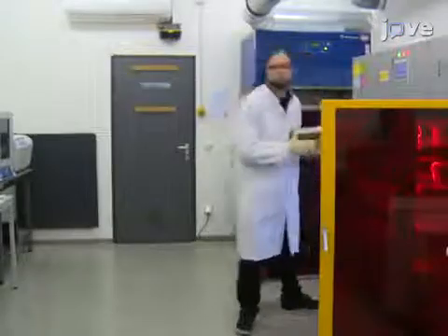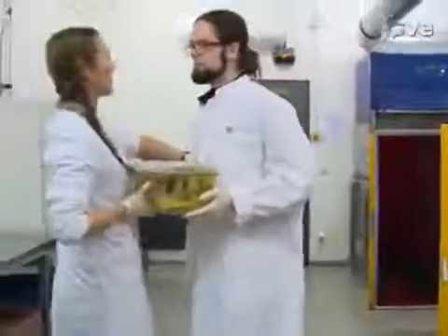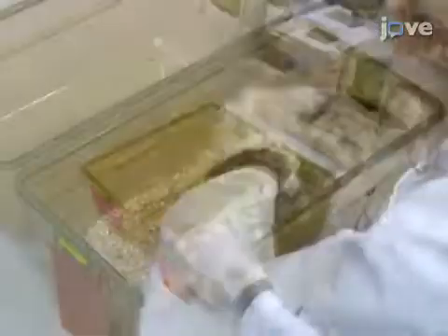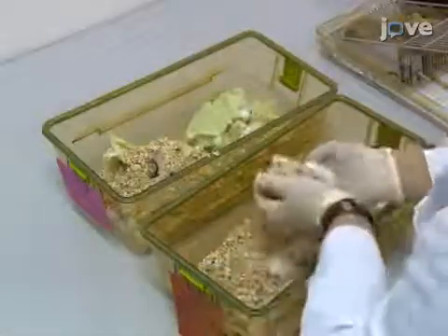Before beginning the experiment, transfer the home cage to a quiet environment. Then remove all objects from the home cage to use it as a training area. Then transfer the cage companions out of the home cage, leaving only one training mouse.